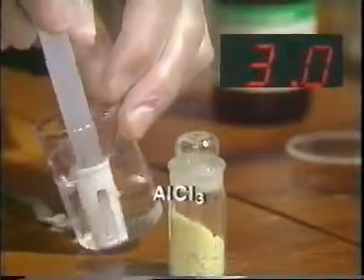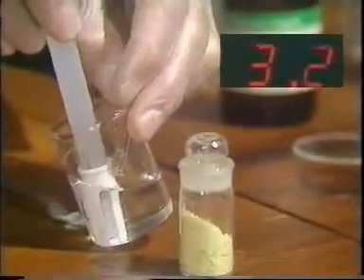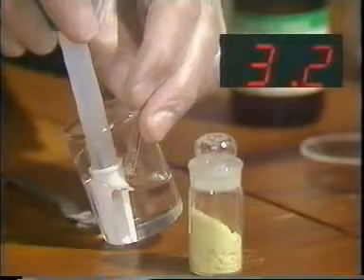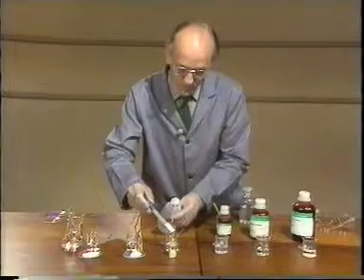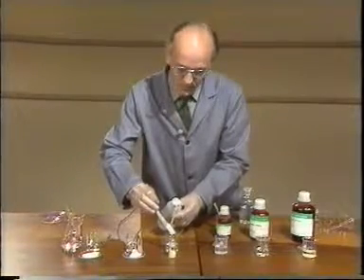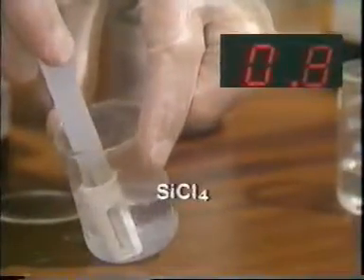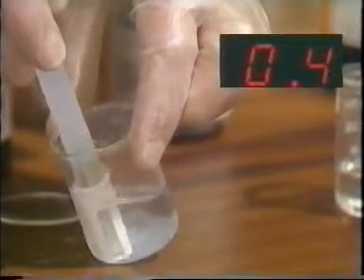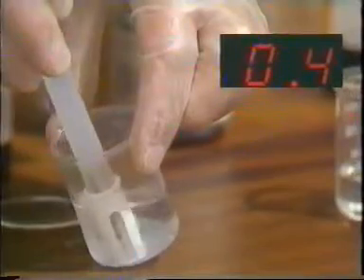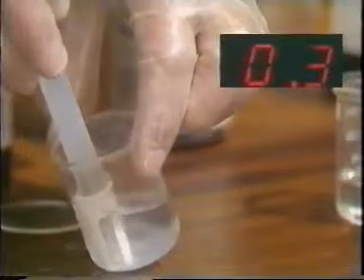Now here we've got a very definite fall in pH down to 3.2. Rinse the probe carefully. On to the next one, the silicon tetrachloride. And you can see here that the pH has dropped right down to 0.4, 0.3 even.